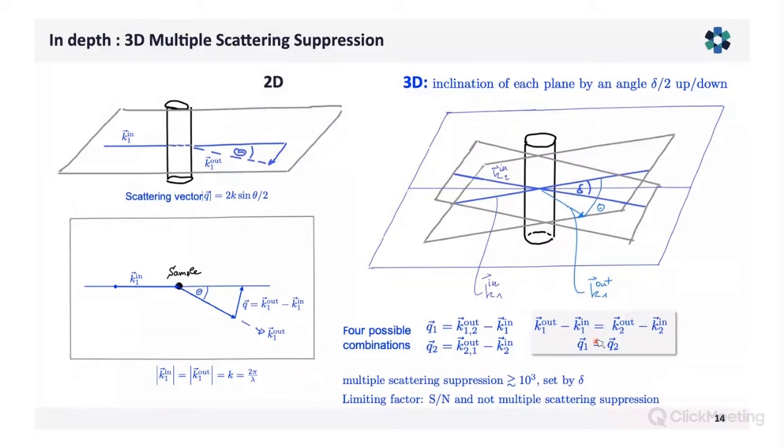This suppresses the signal by a factor of 1/4 without changing the quality of the signal, but it reduces signal to noise. If you get additional multiple scattering, it further reduces the signal to noise without altering the quality of the information, because multiple scattering is not affecting the signal shape, for example, the correlation function.